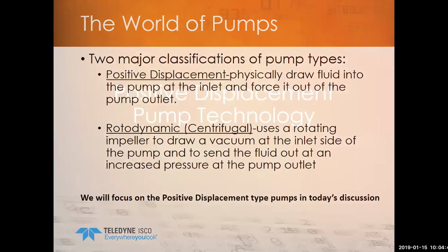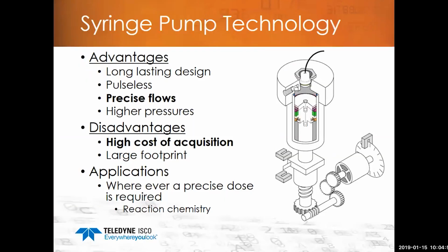But let's move on to positive displacement pump technology. We're going to talk a bit about the different types of technologies that are out there in the positive displacement world. So first and foremost, you have syringe pump technology. And this is very simple.